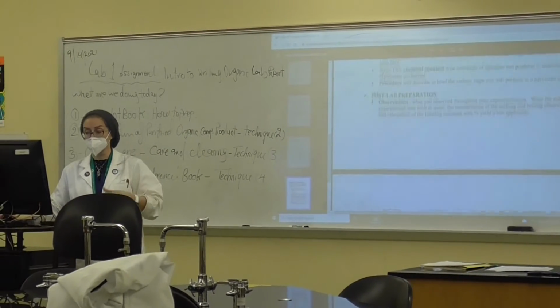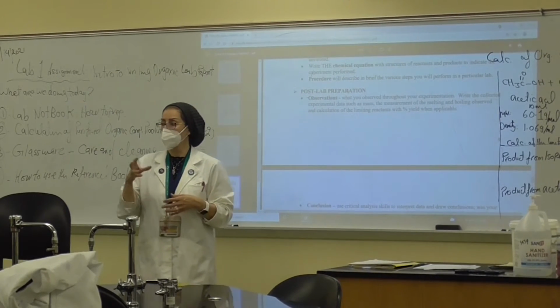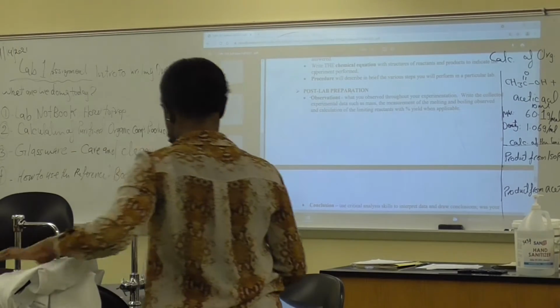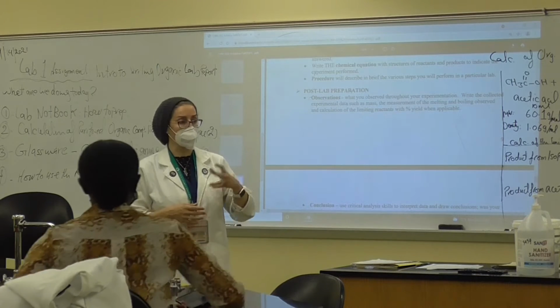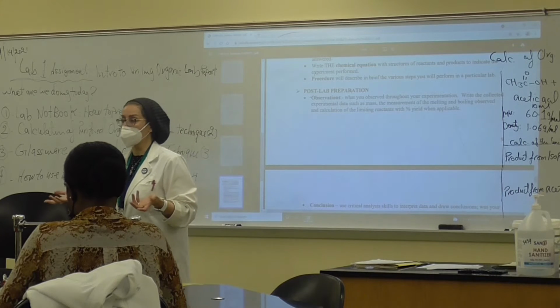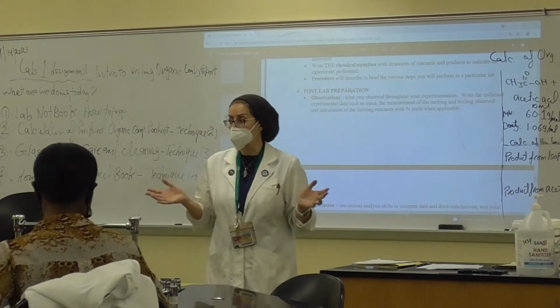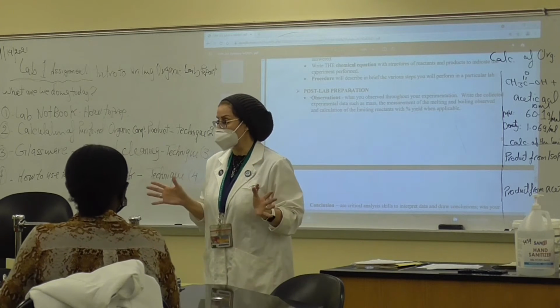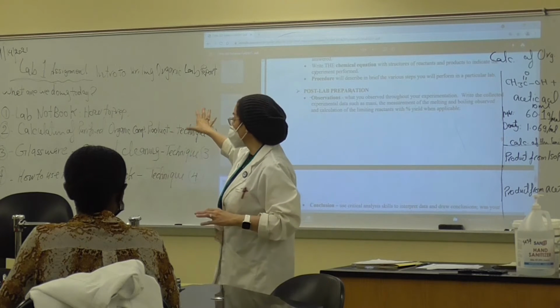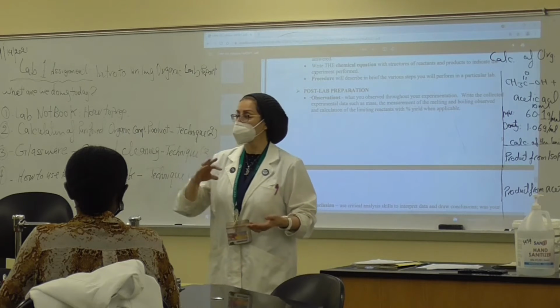Then during and after the conduction of the experiment, we are going to observe. There are changes. For instance, it was a solution, and all of a sudden we have precipitation or color changes. Sometimes we are not going to be successful. Maybe we're not going to produce any product. That's also fine. It is possible. That doesn't mean you are going to fail the whole writing and not be able to present your report. Rather, this is very important.